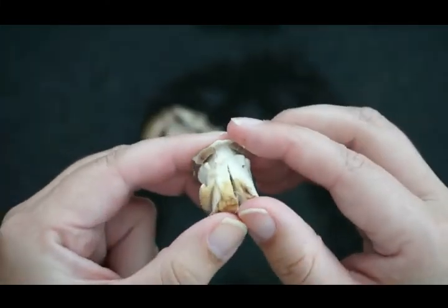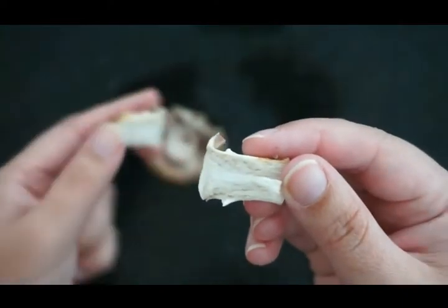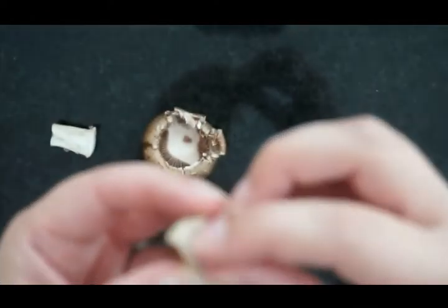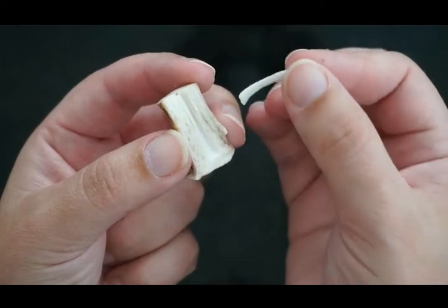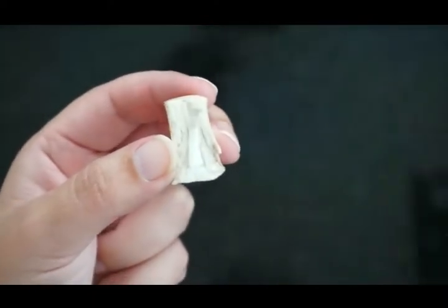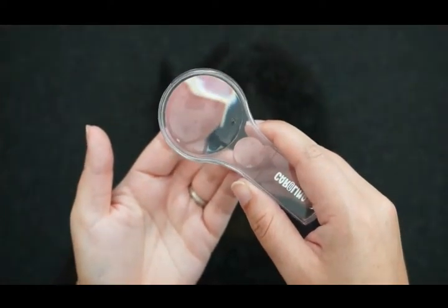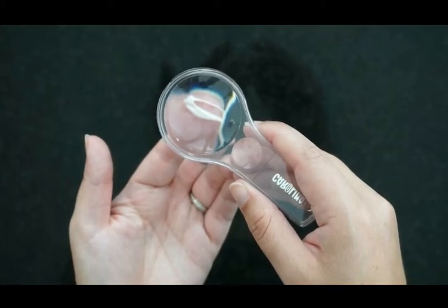Then you're going to take your stalk and pull it apart so you can see some of the individual hyphae in there. They are pretty small, and what you're looking at is the whole network — the mycelium. But if you take a look at just a tiny part and use your magnifying glass, you should be able to see some of those tiny hair-like hyphae. You'll want to draw a picture of those as well.